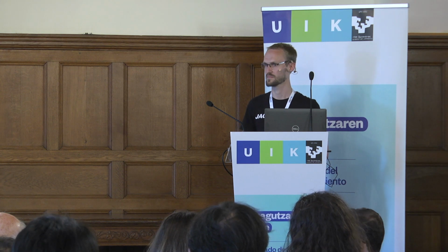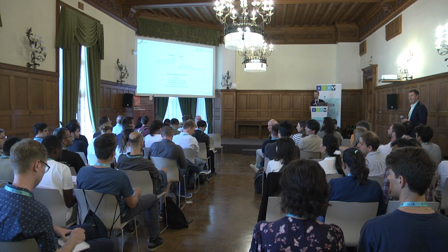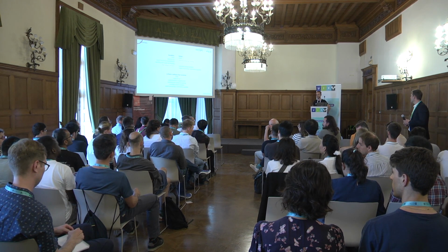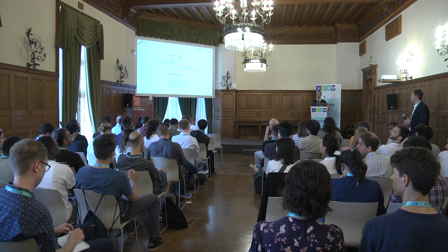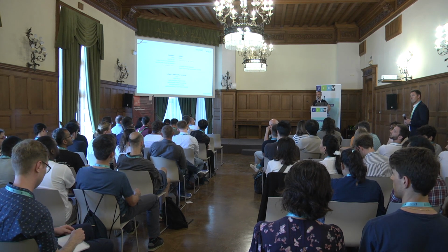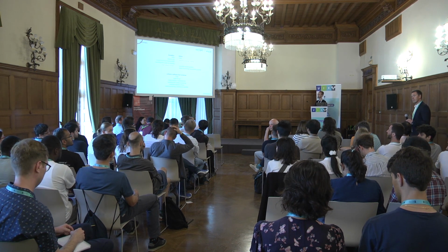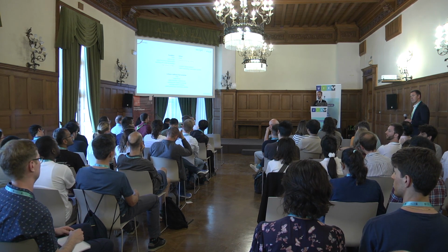Thank you. Thank you for the presentation. I just have a comment maybe here that best would be not to choose one, but actually to be able to work both in Gwyddion and others, which in my case it's MATLAB, because you have some benefits here and some benefits there, and there is no single software golden solution to fit both. And one thing which is missing here, when you work with polaritons, sometimes you need to do Fourier transform of the signal. And Gwyddion is not even close to that.